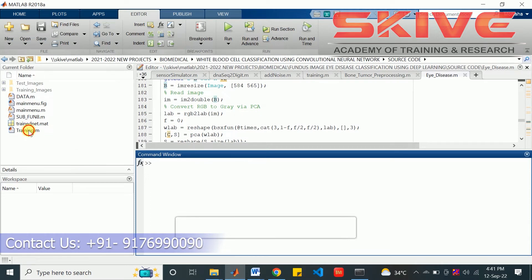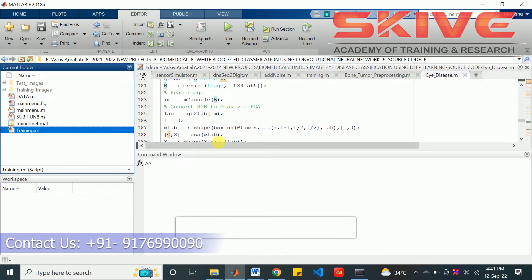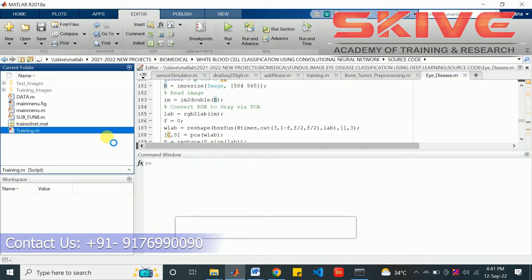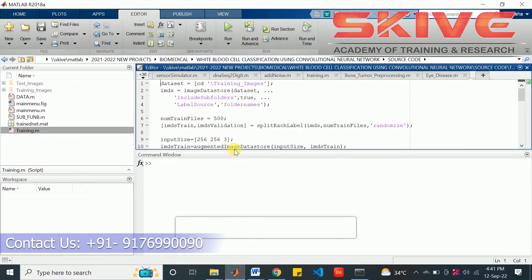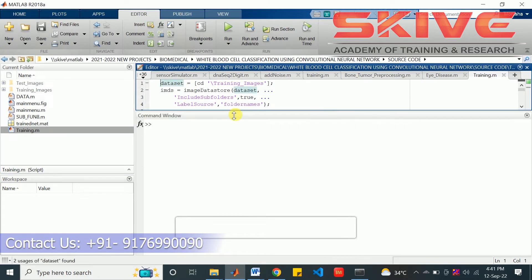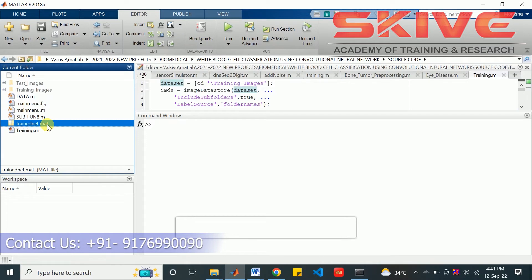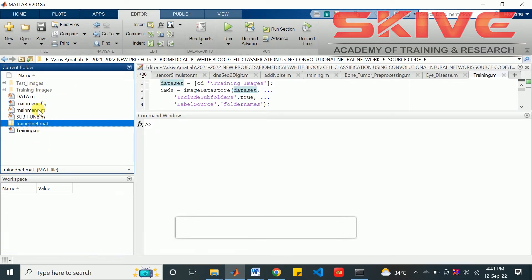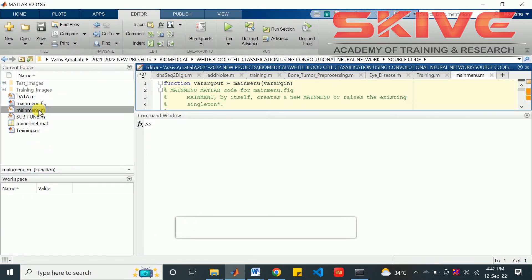This is the training process. In the training process we can have many layers for training. This is the model we got from the training output. We can easily use this model with the project.